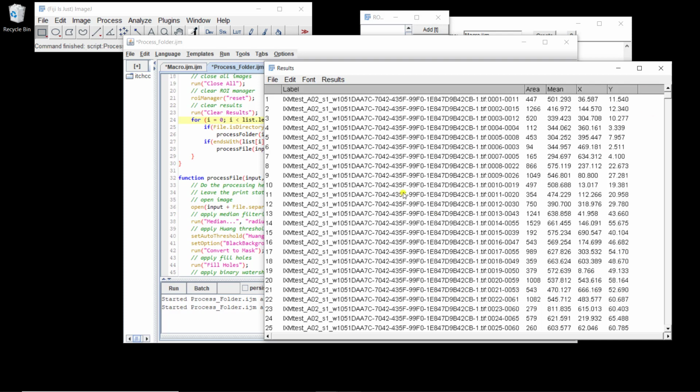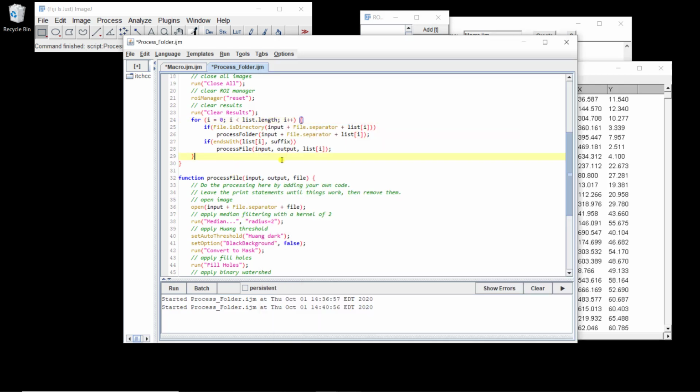Maybe you have some images that act as outliers too, and you can't process them the same way and it won't work. How can you know that? You should always add an output that allows you to visually inspect the results.